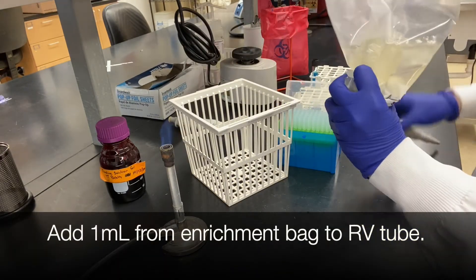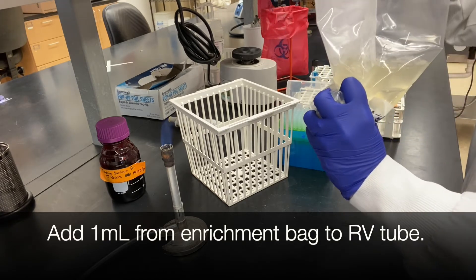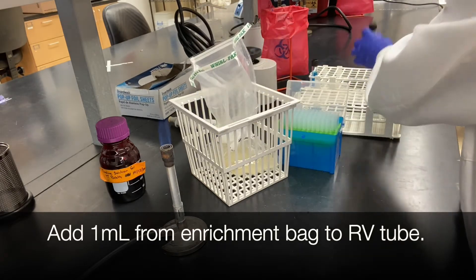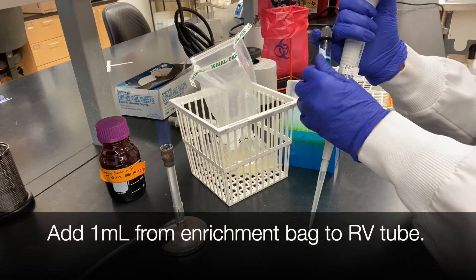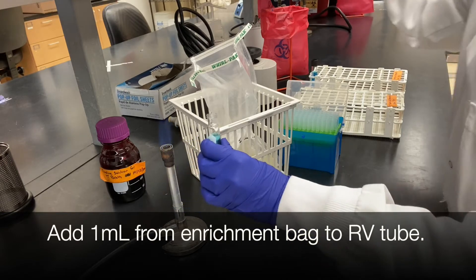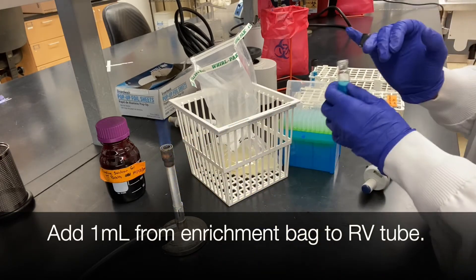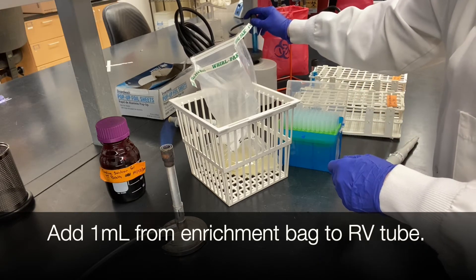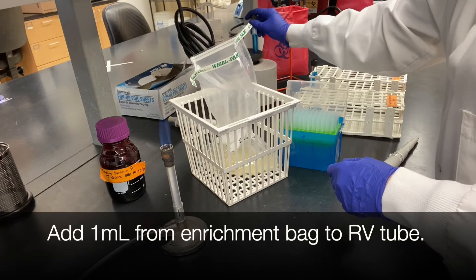Add 1 ml from your enrichment bag to your Rappaport Vassiliadis or RV tube. Inoculate your tetrathionate tubes at 37 degrees Celsius for 24 hours. Incubate your RV tubes at 42 degrees Celsius for 24 hours.